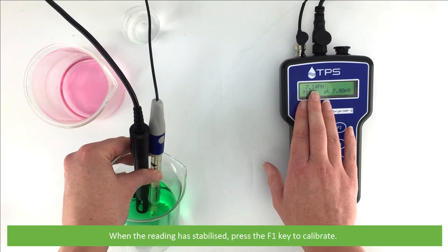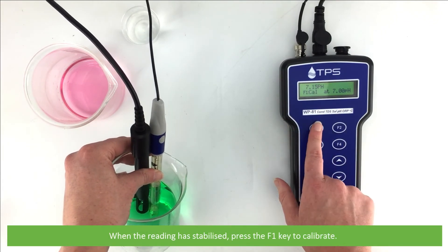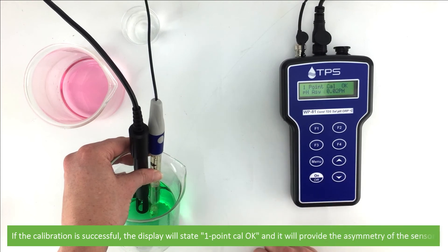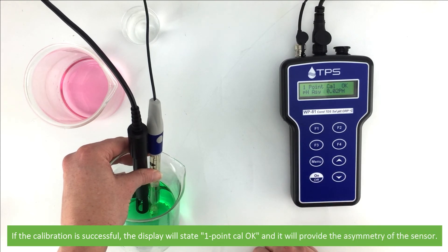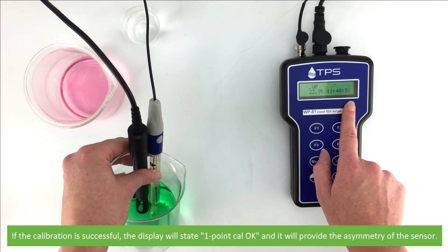When the reading has stabilized, press the F1 key to calibrate. If the calibration is successful, the display will state 1.Cal OK and it will provide the asymmetry of the sensor.